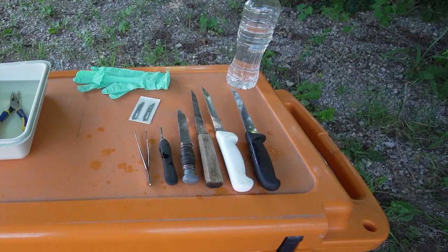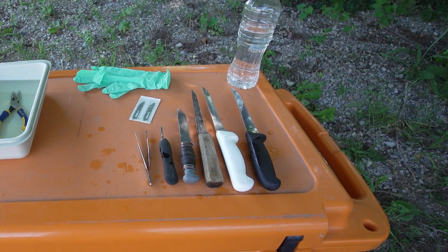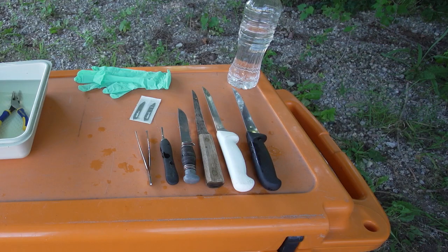Once you remove the tools from the bleach, rinse them thoroughly and allow them to air dry in the sun if possible. Items that cannot be submerged should be cleaned, sprayed with a 50-50 bleach solution, and allowed to dry in the sun. Be safe and, as always, happy hunting!